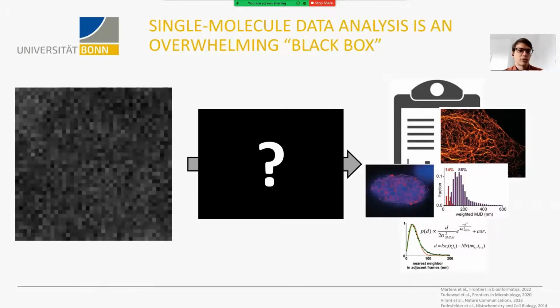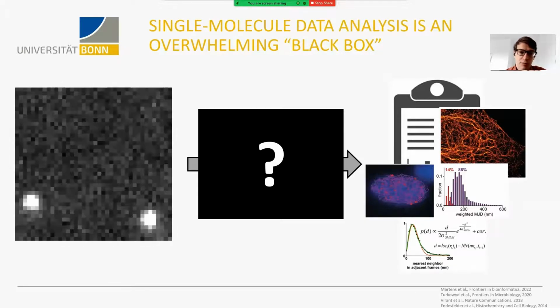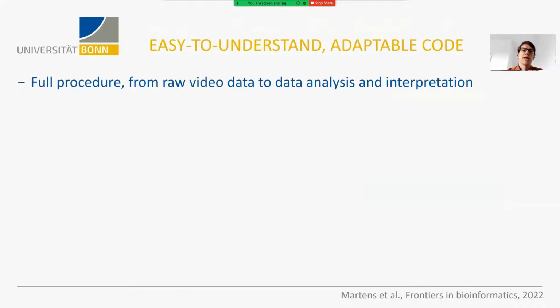And our manuscript was a way to circumvent this black box. So what we created is a sort of easy to understand and adaptable code to have the full procedure for SMLM, from raw video data all the way to full data analysis and interpretation.